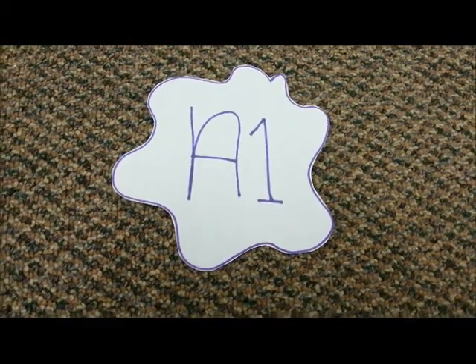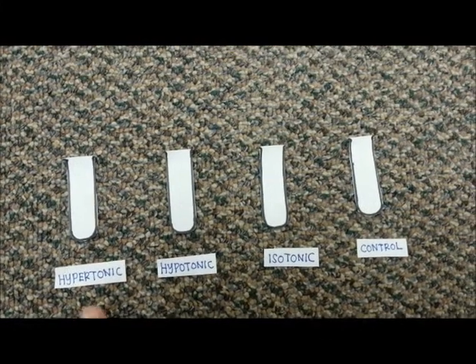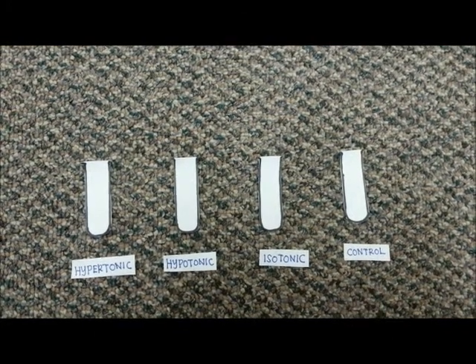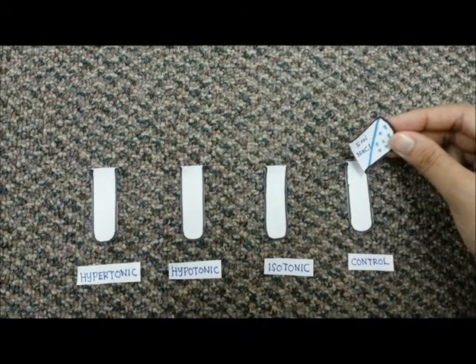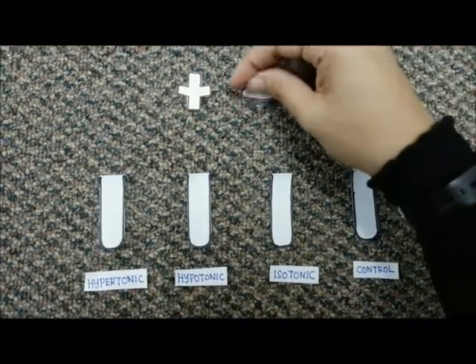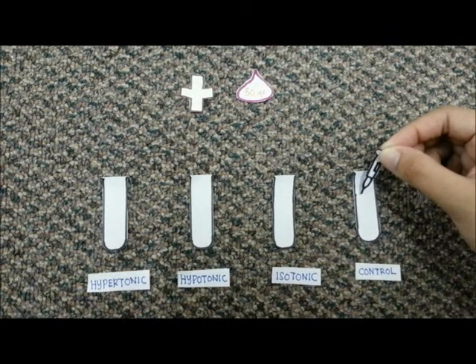In section A1, label the centrifuge tubes as such: hypertonic, hypotonic, isotonic and control, which is the distilled water. Add 5 ml of sodium chloride into each test tube. Then, add 50 microliters of blood into each test tube by using a micropipette.